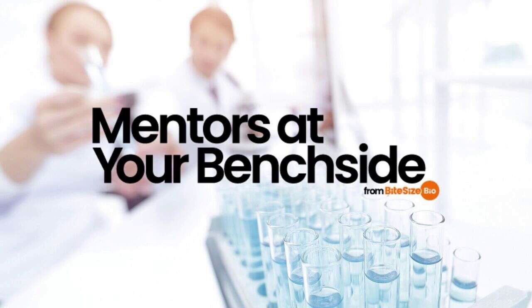Corner load is the term that indicates the ability of an instrument to generate the same readings for an object regardless of where it's placed on the weighing pan. The readings should be the same at all positions on the weighing pan, and if there are errors, they can be fixed during a field service.